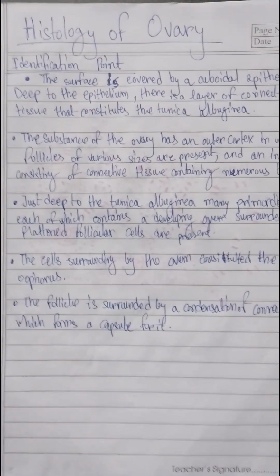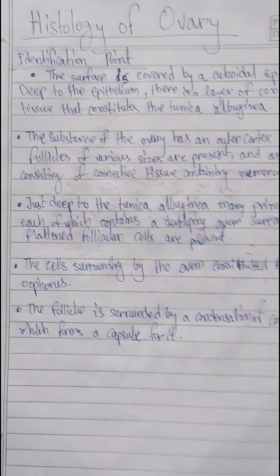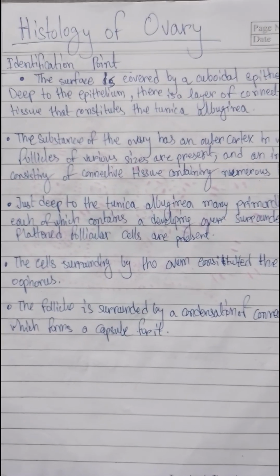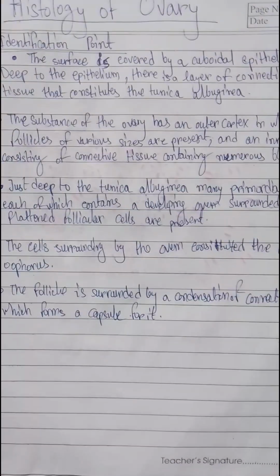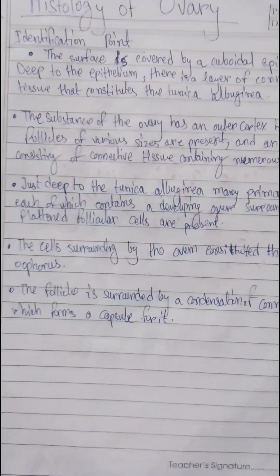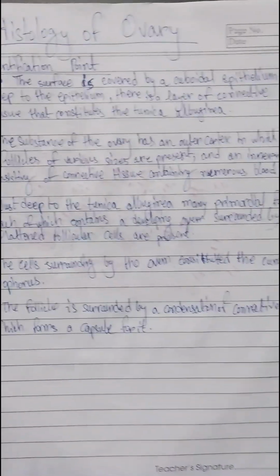Hello everyone, in this video we are going to talk about the histology of the ovary. Here are some identification points to identify the histological slide of the ovary. The first point is the surface is covered by a cuboidal epithelium.